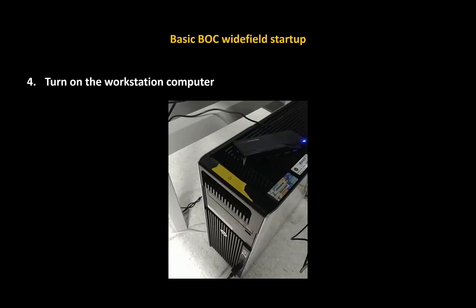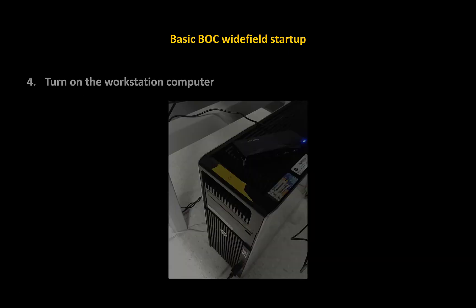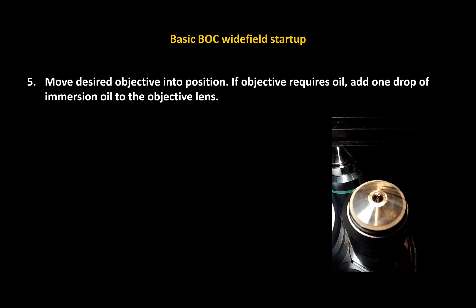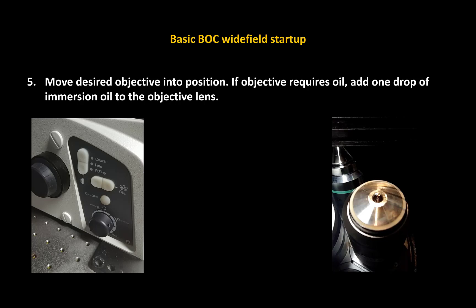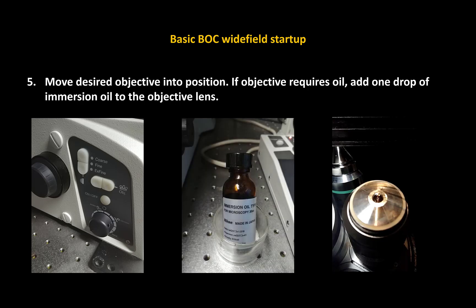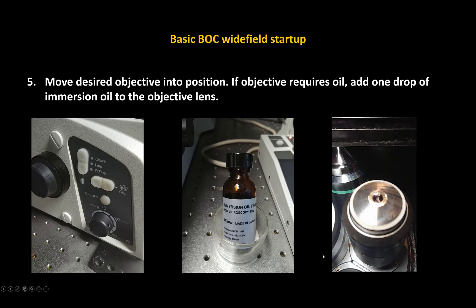At this point, you can turn on the workstation computer and log into your WISC account. After turning on the workstation computer, you're going to want to put your sample on the stage. You're going to want to move the desired objective into position — you can do it either on the microscope itself or through Elements if you've already signed in. You can press the button to move the objective left or right until you get the one you want. If it's an oil-based objective, you're going to want to add just a single drop of oil to that objective. The oil will likely be on the left or right side of the microscope system. Here I'm showing just one drop of oil, which is an ideal amount.